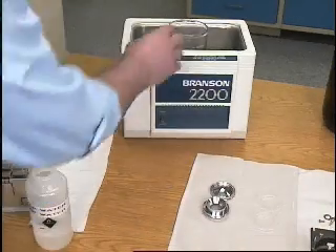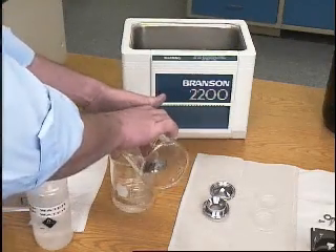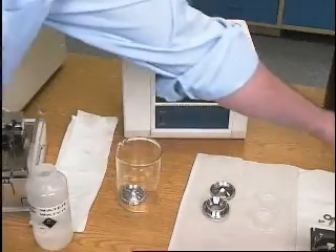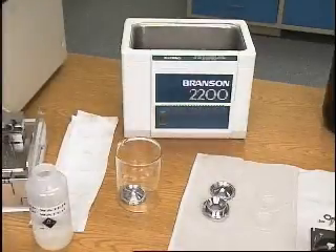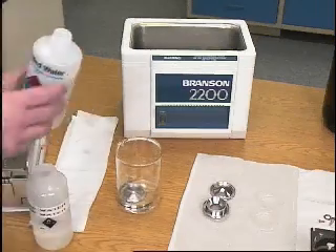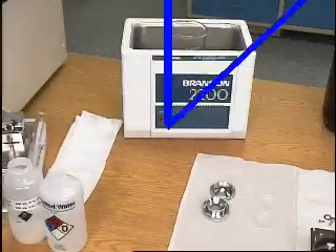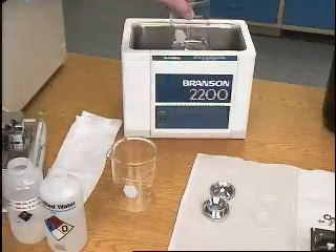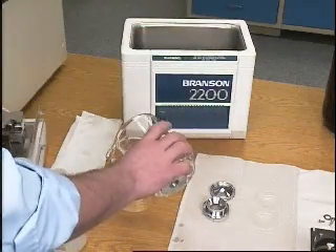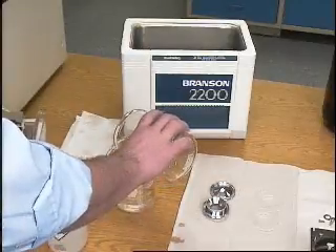Place the parts one at a time into a beaker, add deionized water, then subject the beaker and its contents to ultrasound for about one minute. If the water is cloudy afterwards, replace the deionized water and repeat the process. Repeat the process for each electrode.